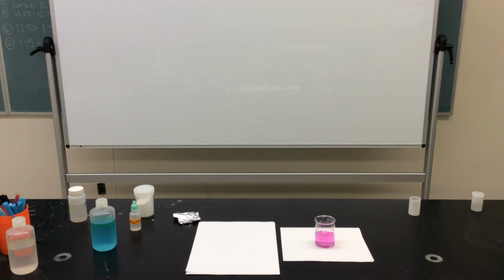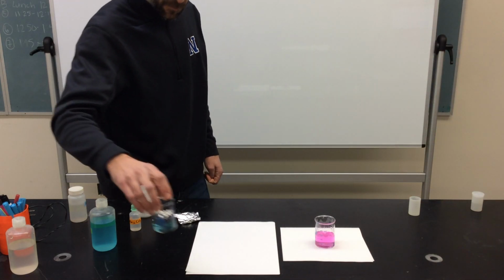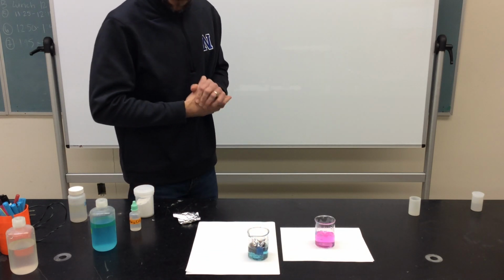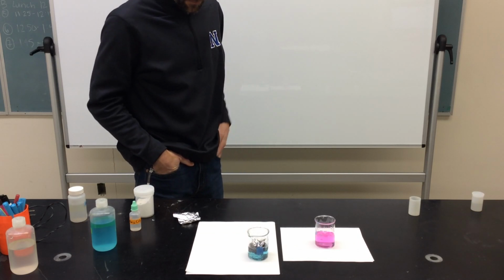What do you guys see on the foil there? Bunch of little bubbles. We got bubbles. And what happened to my nice shiny foil? Above the water line, it's still nice and shiny, but below the water line, it's not so nice and shiny anymore, is it? You get some brown goop on there. That's what we call a precipitate. It's a solid that is formed out of a liquid. And so that's another piece of evidence that a chemical reaction has occurred. So we've got color change, we've got precipitate, we've got bubbles.